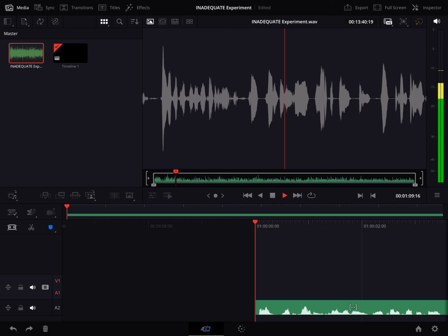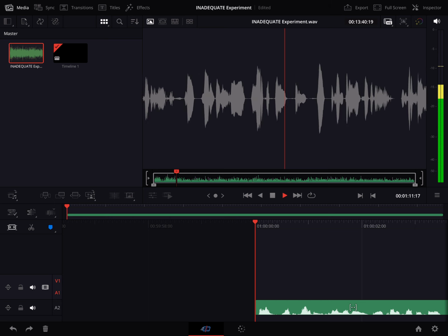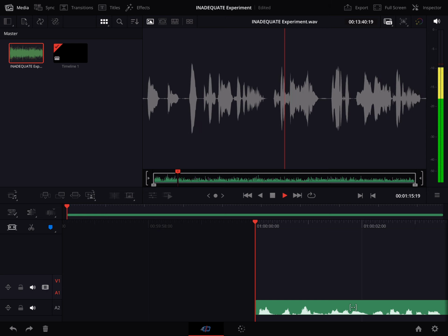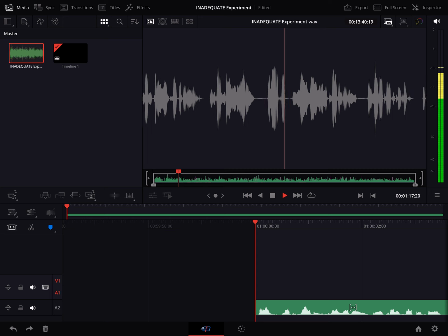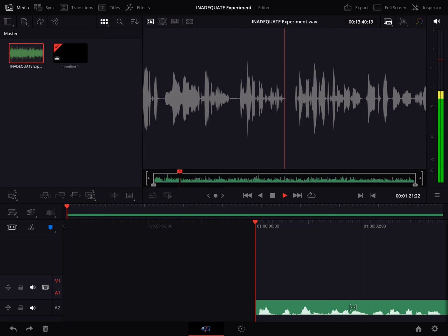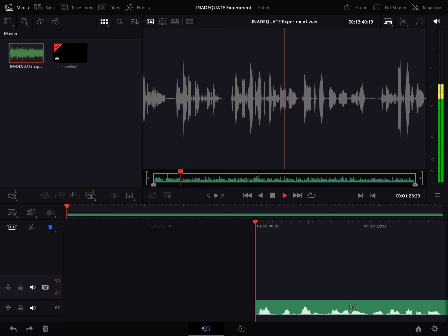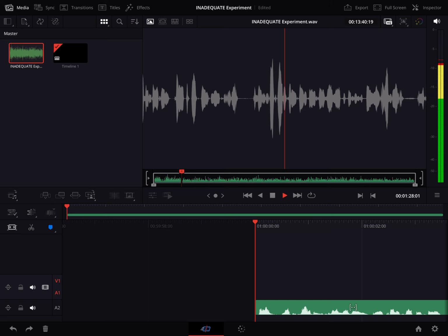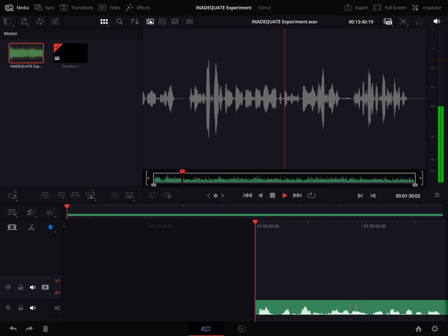So, where does this INADEQUATE thing fit in? Well, it's a specialized type of NMR. Instead of showing all the atoms, INADEQUATE zooms in on the carbon atoms and how they're connected to each other. Okay, so it's mapping out the carbon skeleton, kind of like the backbone of the molecule. Yeah, precisely. That's got to be pretty important for understanding how a molecule functions as a whole, right?